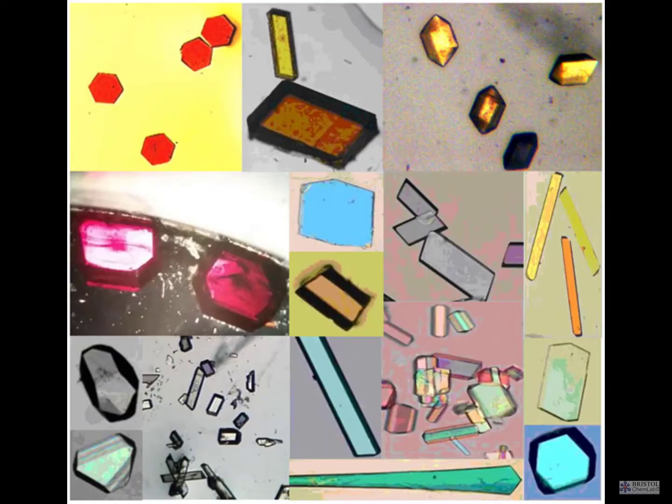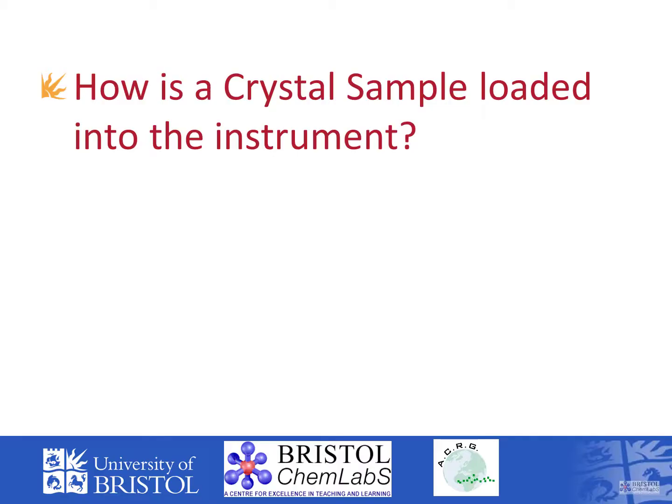We can get many different shapes, sizes and colours of our crystals depending on both the molecule and how it packs in the crystal structure. However, what's not clear from the images is exactly how small our crystals actually are.